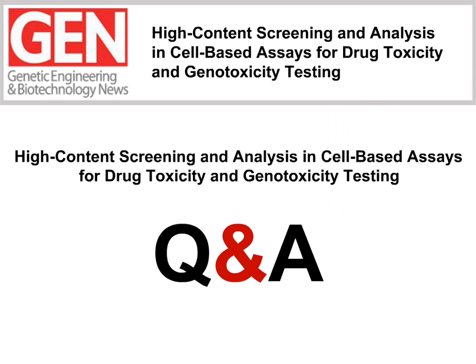All right, Heather. What percent DMSO did you use in the first experiment, and how did DMSO compare to a no DMSO control? Okay, all experiments were done with 0.2% DMSO, so it was constant across the plates. And initially we did some experiments, and this level of DMSO has absolutely no effect compared to a no DMSO control. The numbers for all the outputs were identical.